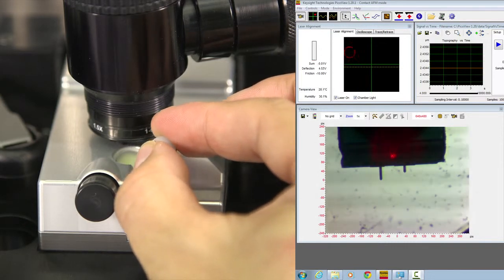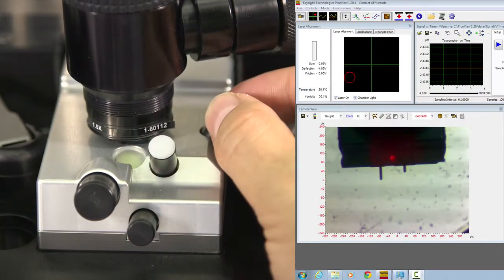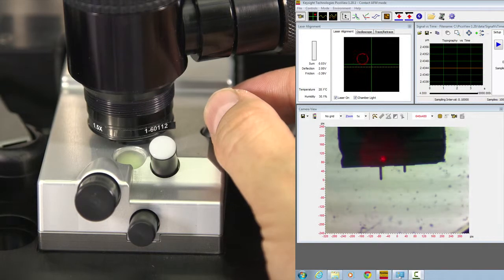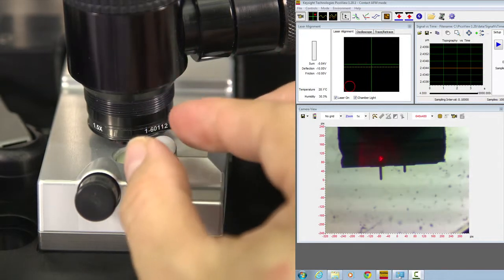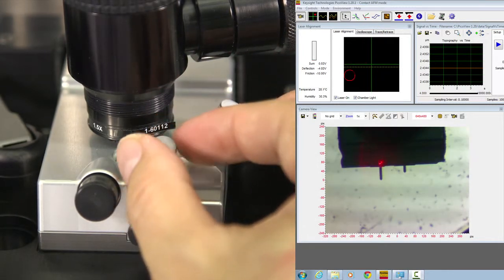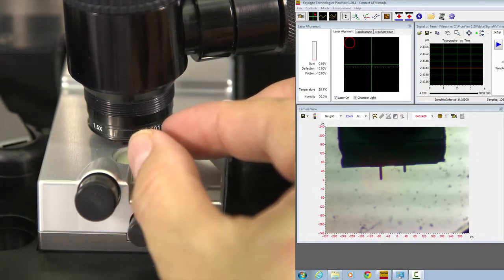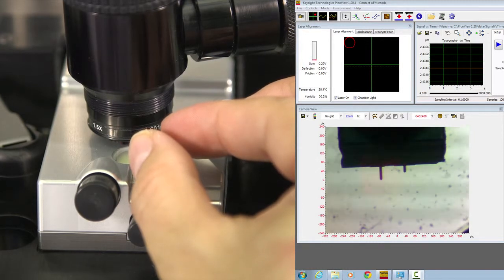Use these knobs to move the laser spot on top of one of the cantilevers you choose to use. Move it close to the end.